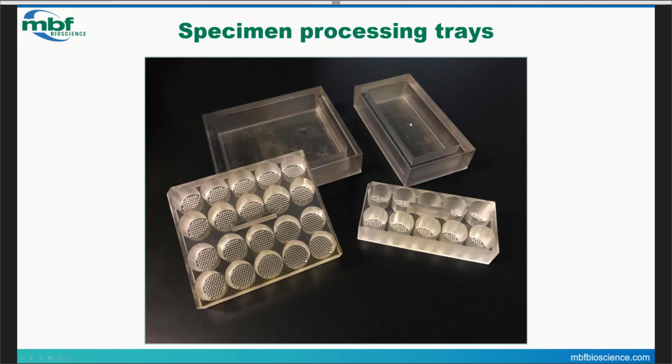Now I'm going to describe how we take those sections that have been processed and reconstruct whole brain volumes using the NeuroInfo software. So Nate, can you switch me over? I'm going to make you, Chip, the presenter now. At the end, I'll put up a link to the 3D printing files, so that if you wanted to print these yourself, you'd be able to do that.